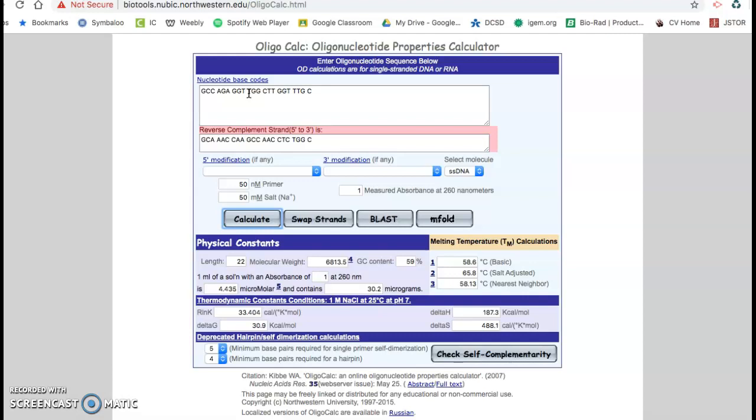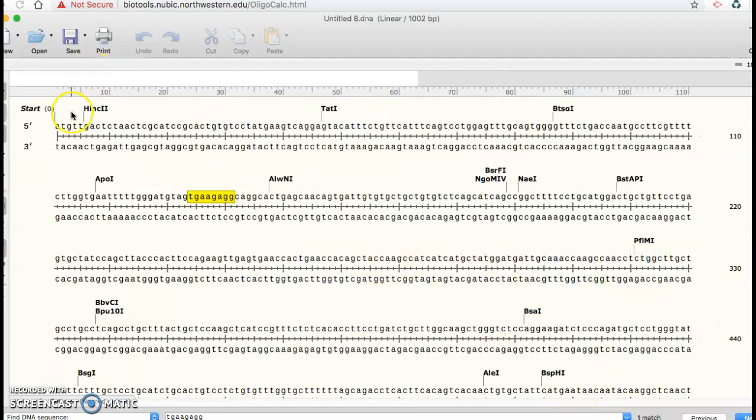Now those are going to be my 2 primers, and I've pretty much accomplished all the goals that I want. I've got the length correct. My GC content is good. My melting temperature is pretty darn close to 60 degrees. If this was actually me and I was actually designing these primers, I would keep going until I got something that was very, very close to 60, and I would just kind of play around with this a little bit, right? But then your other criteria is met in that we've got something, the forward primer's way over here, our reverse primer's way over here, so now we know that our sequence is going to be a nice clean read, and this is where our SNP is at, and that's the thing that we want a clean read of.